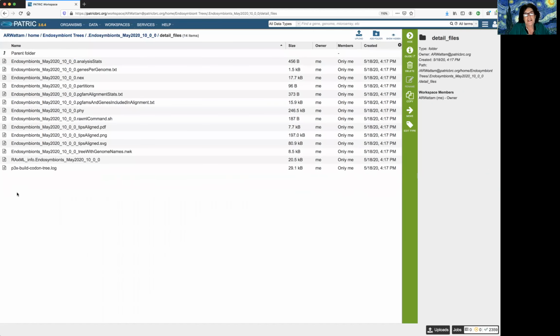And oh my gosh, look what this opens. A whole bunch of other stuff. Genome analysis stats. Those are included in the report that we talked about earlier. And so it's in the report, but if you want to download it, maybe put it in a publication, that's a downloadable format for it.